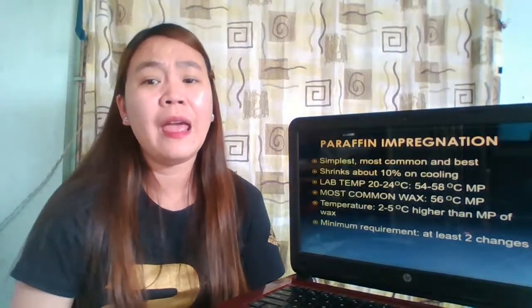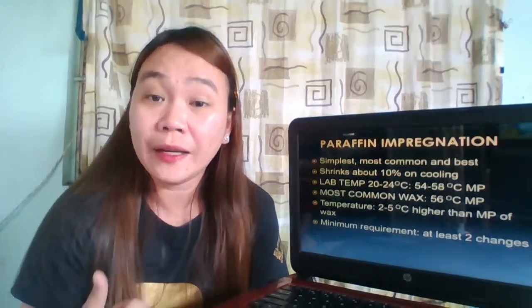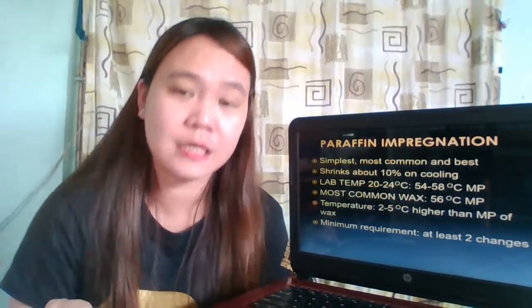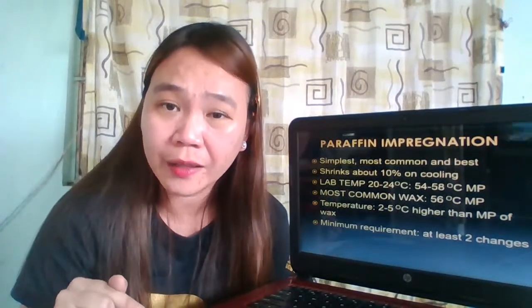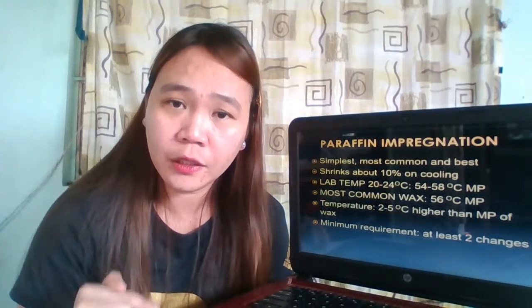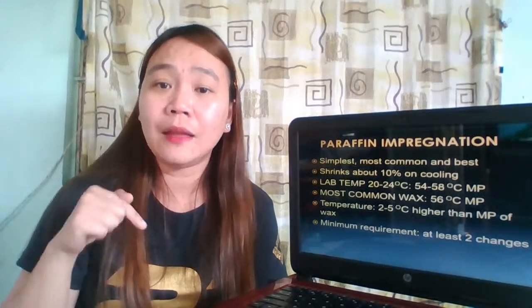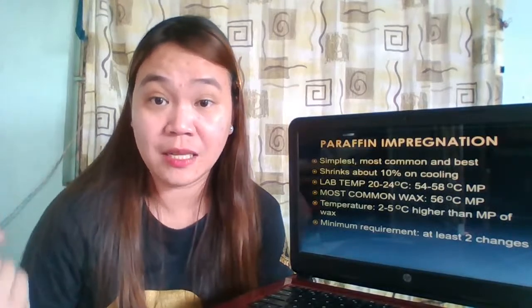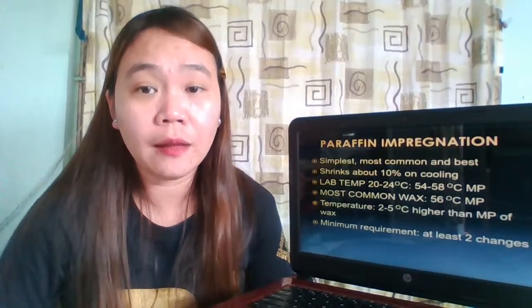Of course, since your tissue is hard, you make use of high melting point paraffin wax, then what becomes of your block? Your block will also become hard. Right? The block that you produce after embedding would also be hard, and it will determine the type of microtome that you use later on during sectioning. These are all connected to one another.